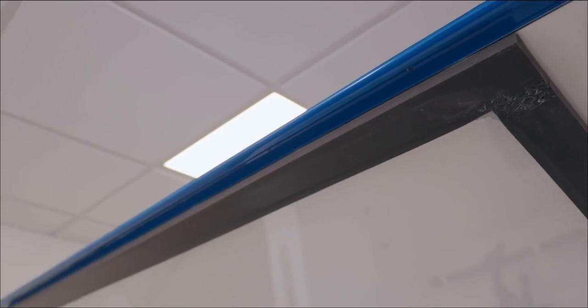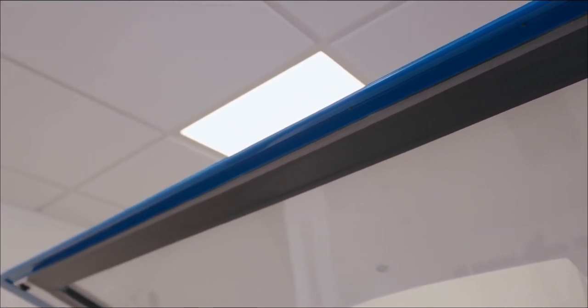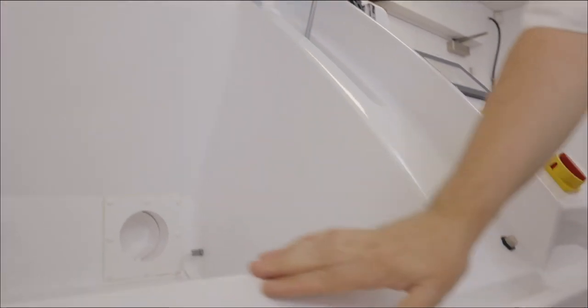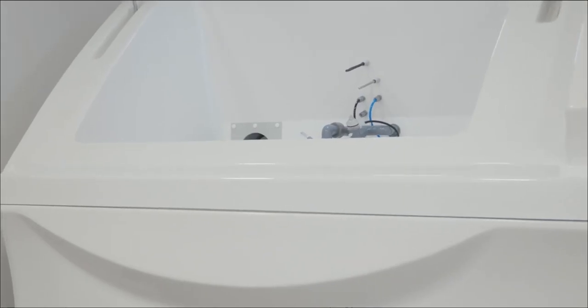If we take a final look at the canopy, the canopy has a dry sealed gasket. It gives an effective seal against the inner surface of the chamber preventing the conditions from escaping during testing. This also has the effect of allowing the user access to the chamber without getting wet.